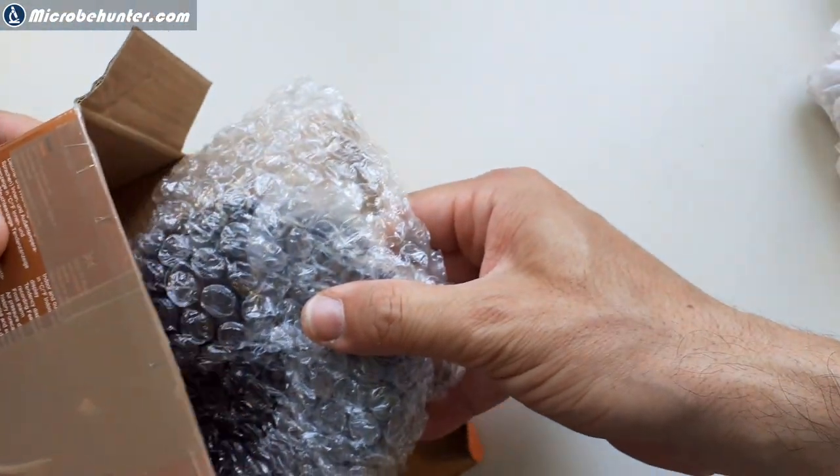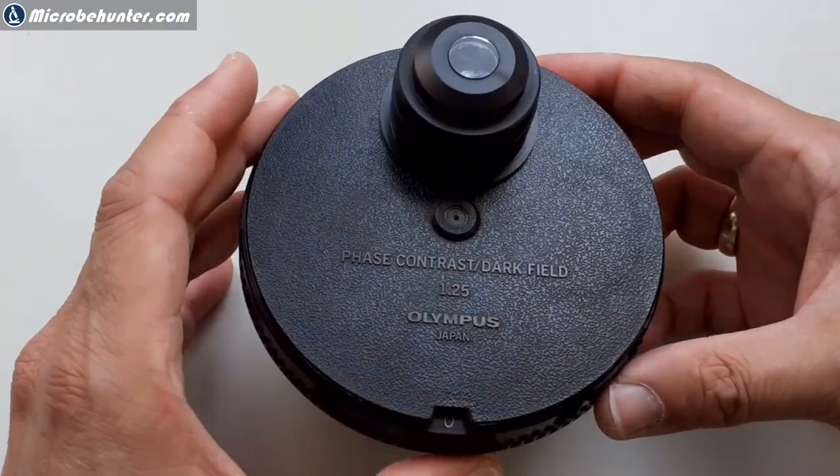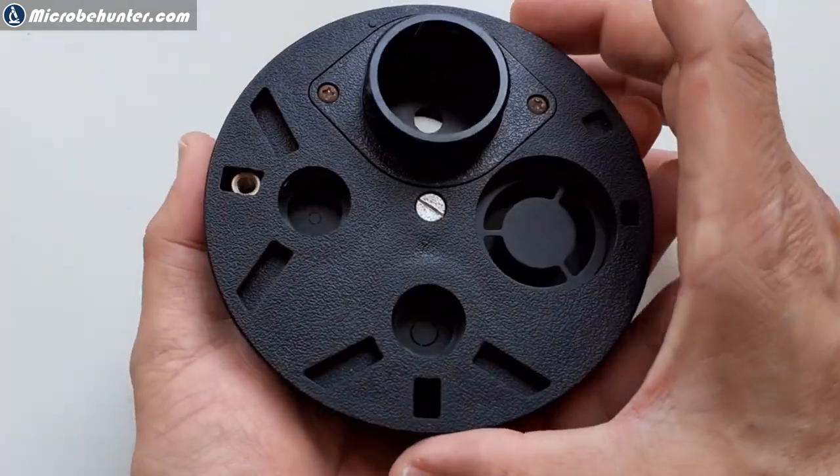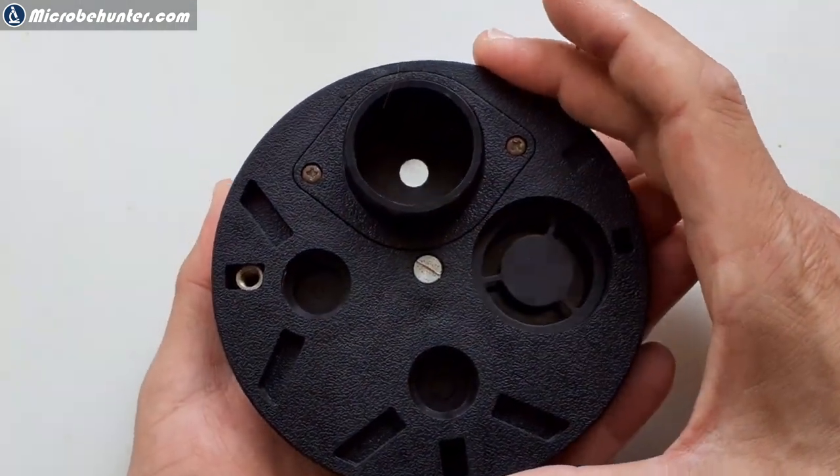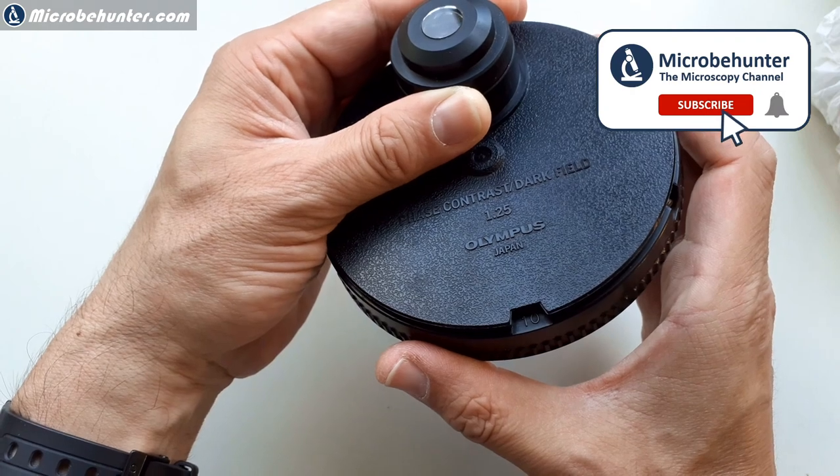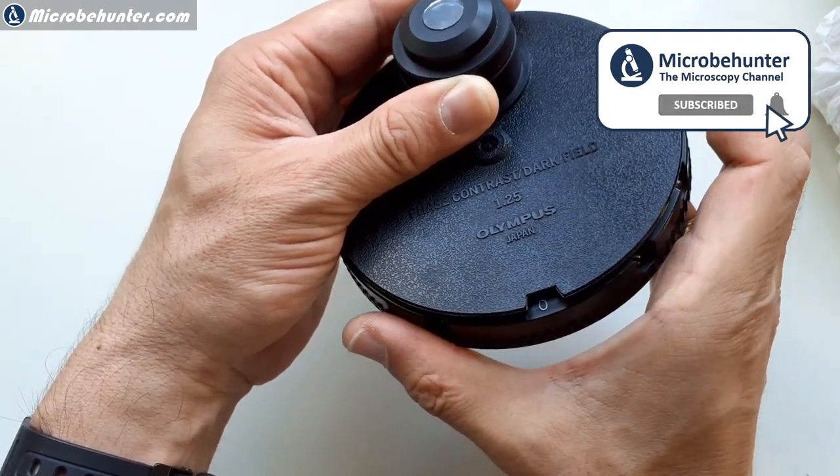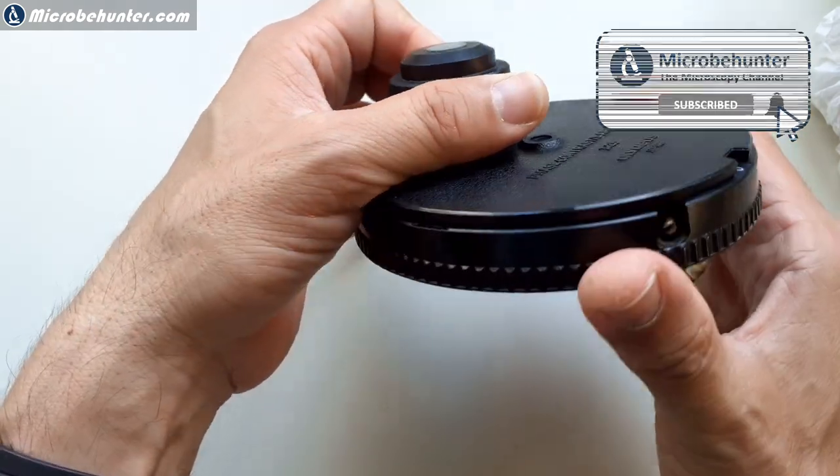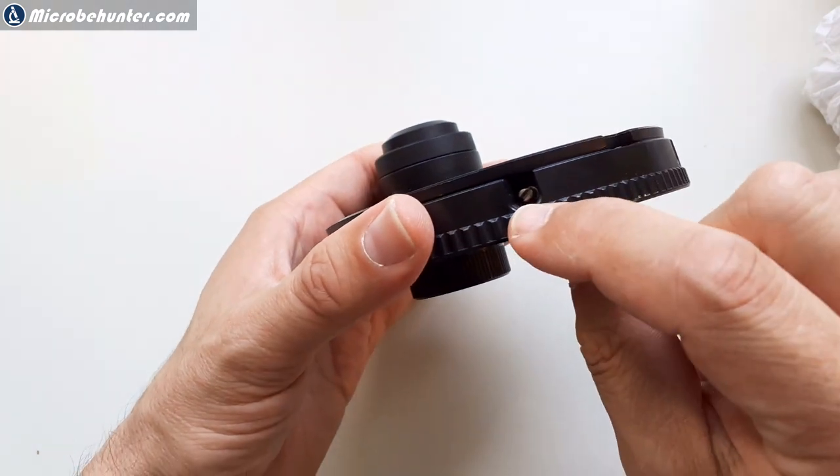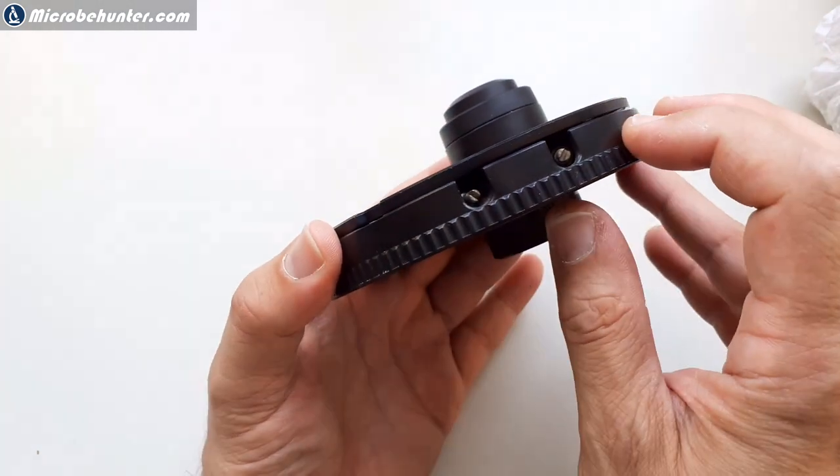I'm going to start with unpacking and connecting the phase contrast condenser to my microscope. The condenser is an original Olympus condenser, a little bit difficult to find these days because it's not manufactured anymore. To my surprise, made fully of plastic. My other condenser, which was older, was actually fully made of metal, but it doesn't matter because it actually works quite well.